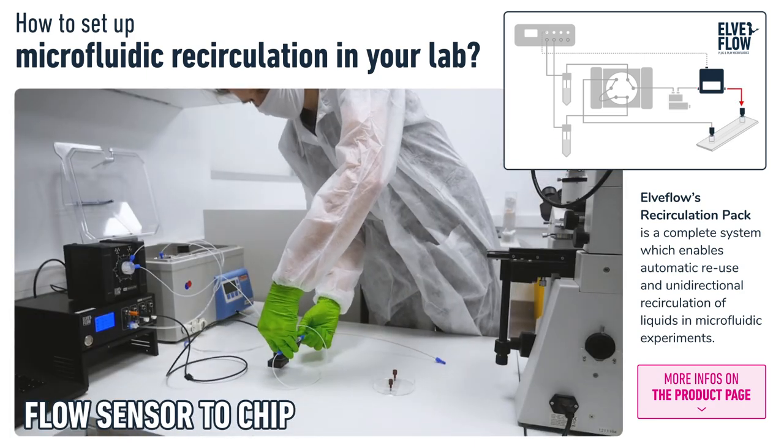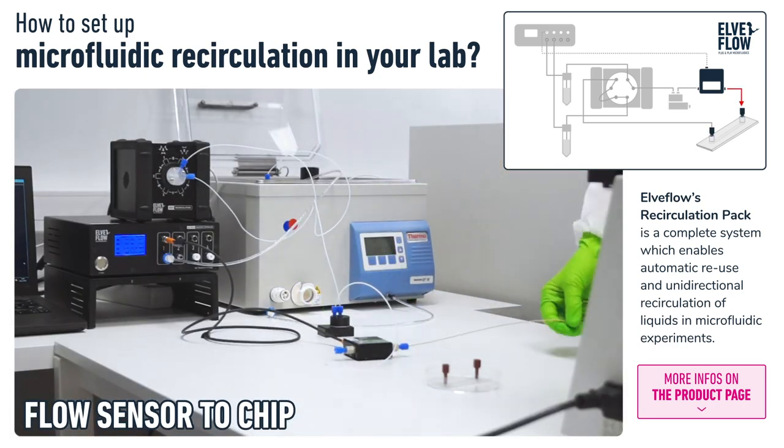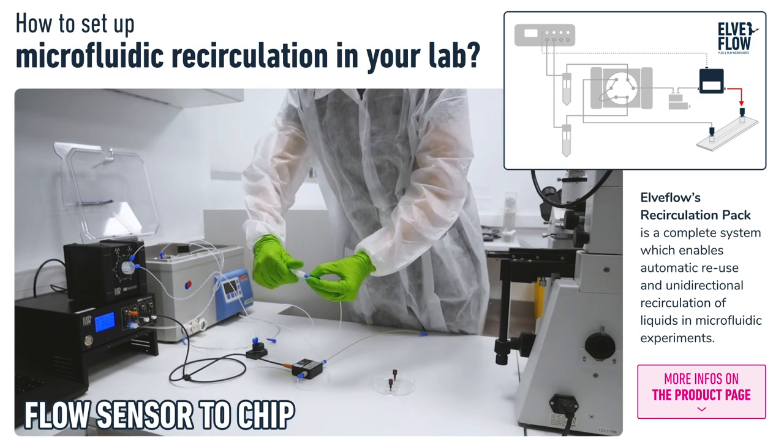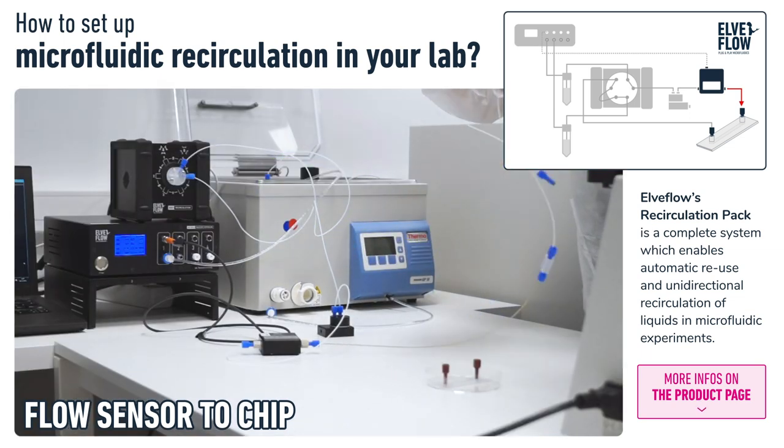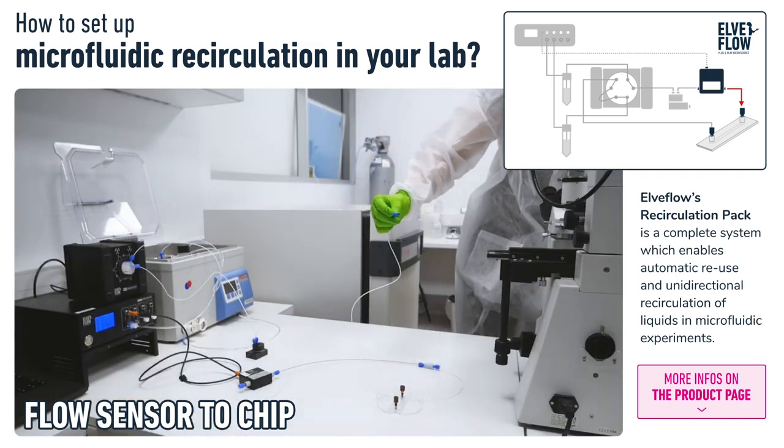Then the flow sensor connects to the chip. Here we are using a union connector in place of the chip for now, so we don't push air into the chip while we purge all the tubing on its first filling.